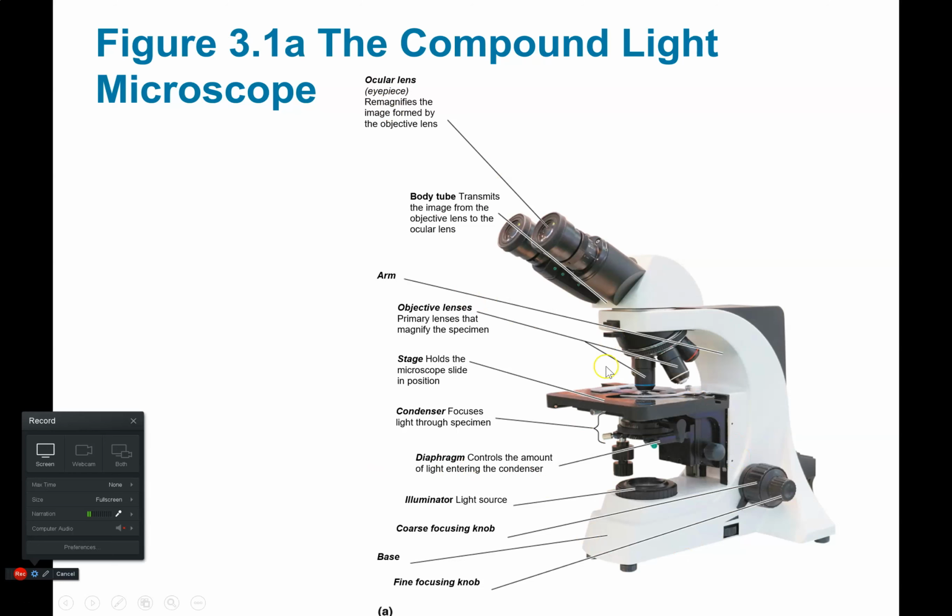You could see all the parts labeled here. This is something, again, if you look at the study guide, you're going to see that you need to be able to label a microscope. This is something you would get tested on kind of double. You could get tested on this for lecture in this chapter, but also in lab from your microscopy chapter.